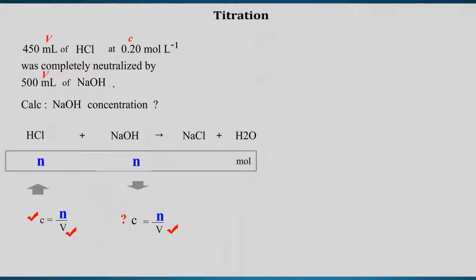What is titration? Titration is using acid and base. When they neutralize, you will know how many moles should equal the same amount of moles. And knowing these two relationships, you can find the unknown concentration of the sample. This is titration.